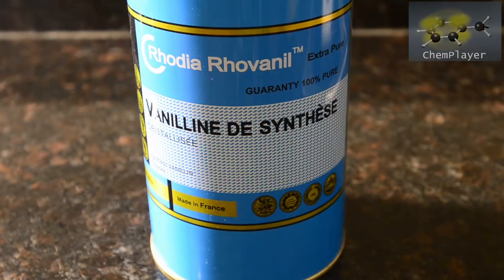We've got a fun-packed video today. We recently prepared some nitromethane, so we thought we'd do some experiments condensing this with some aromatic aldehydes. First up, we're going to use vanillin.